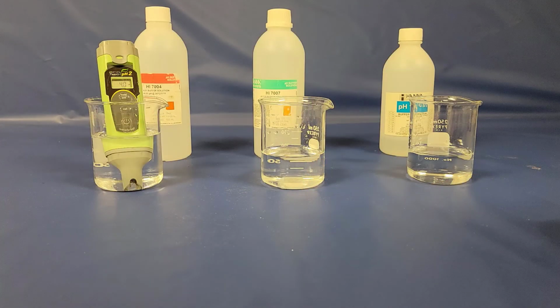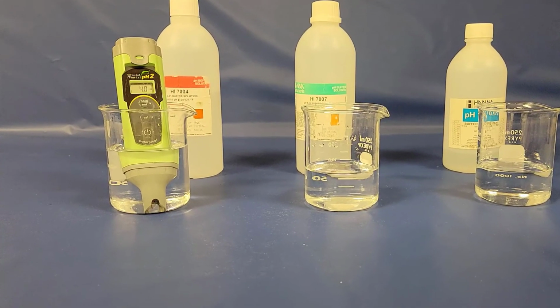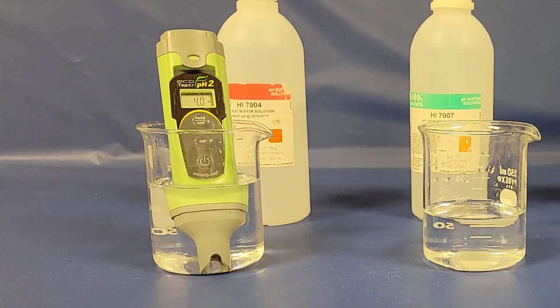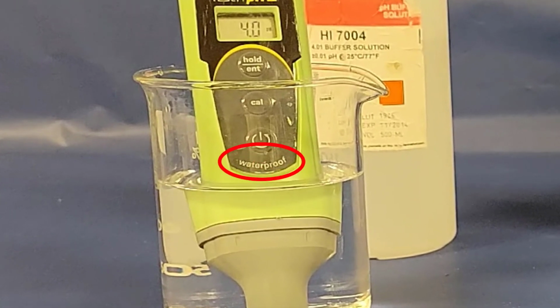One last note on these sensors here. You'll notice that I've got this sensor kind of submerged pretty good in the solution, and this is a little bit of a teaching moment. You don't want to drown the sensors, right? You want just the electrode piece to be in the solution or in the water that you're testing. So in this particular case, it is waterproof, but for some other devices, they may not be. So you really just want the electrode in, otherwise you might damage the electronics of the sensor.